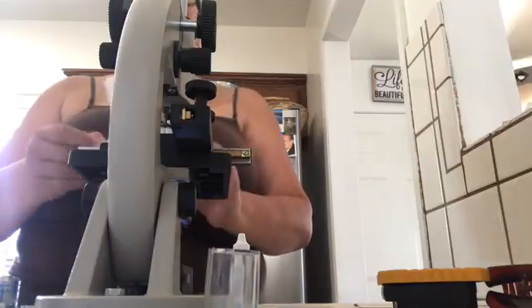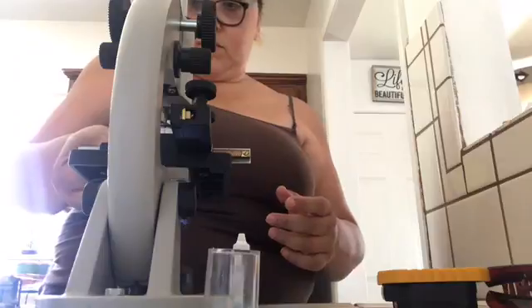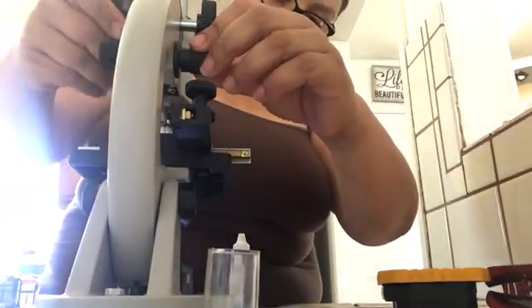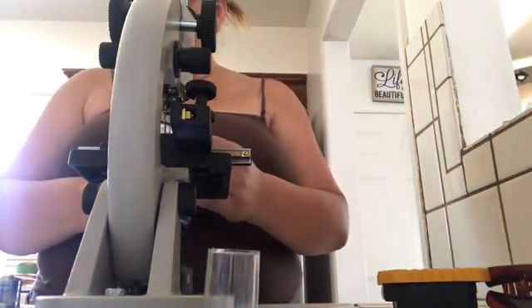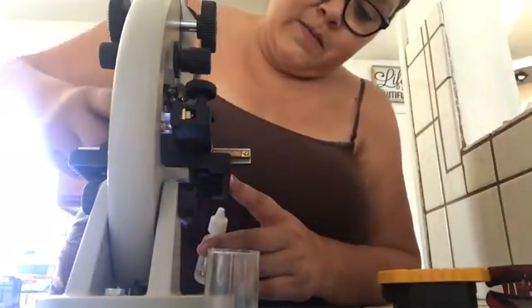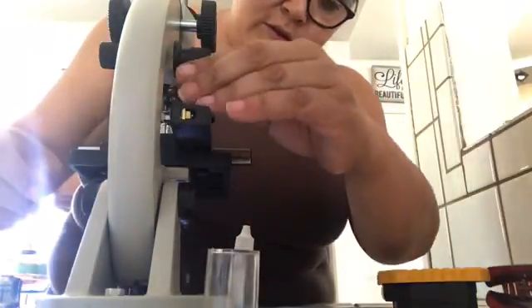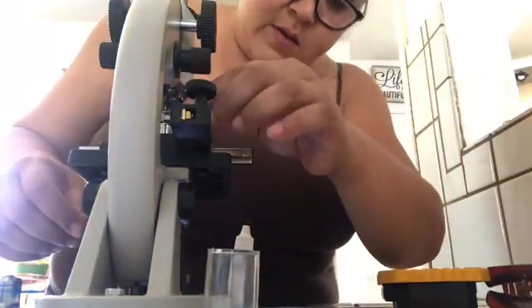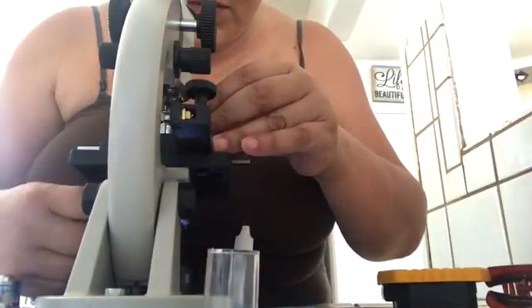So I'm going to clean this lens. I'm going to start off at the scanning though. You always want to start off at the lowest power and then work your way up. I think that's a little too much light.